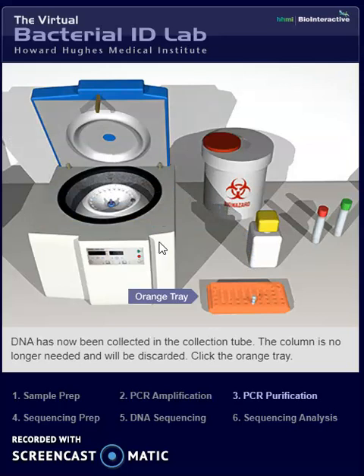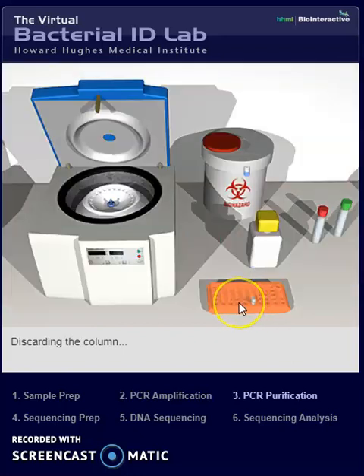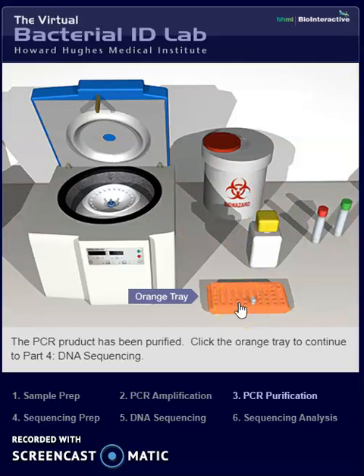DNA has now been collected in the collection tube. The column is no longer needed and will be discarded. The PCR product has been purified.